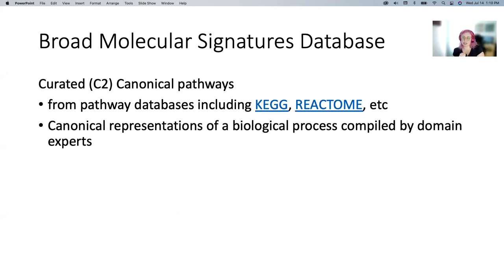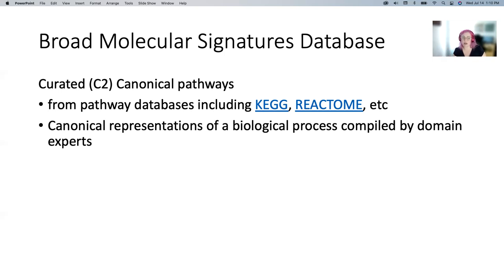Another big one is the curated gene sets, listed as C2. We like the canonical pathways subset. This is Broad going to other databases like KEGG, Reactome, and others, and pulling those gene sets into the same format — which is nice because KEGG and others have different formats. These represent biological processes, enzyme functions, and things like that. Broad describes them as being curated by domain experts, so these are not single-study gene sets — they're more generally held knowledge supported by multiple studies over many years. The canonical pathways subset is almost 3,000 gene sets, representing the majority of the human genome.